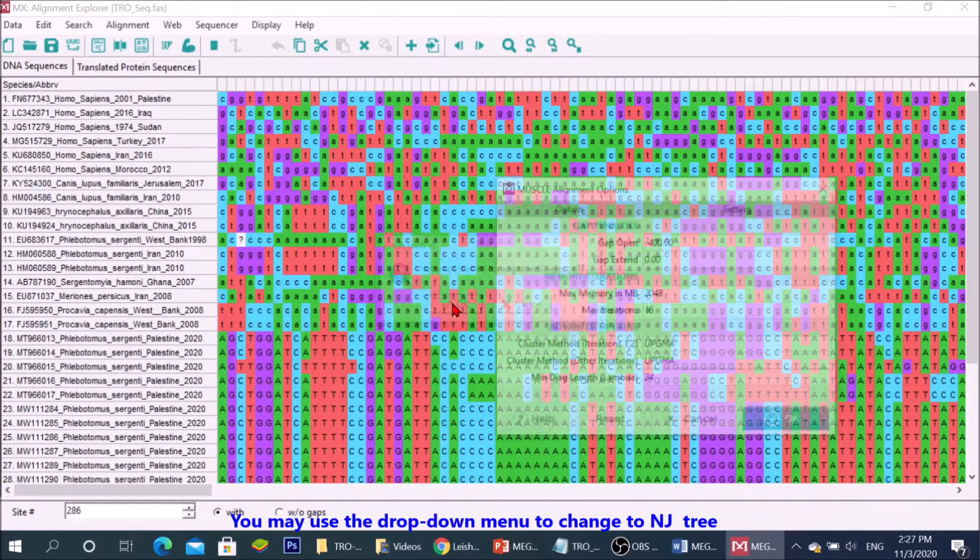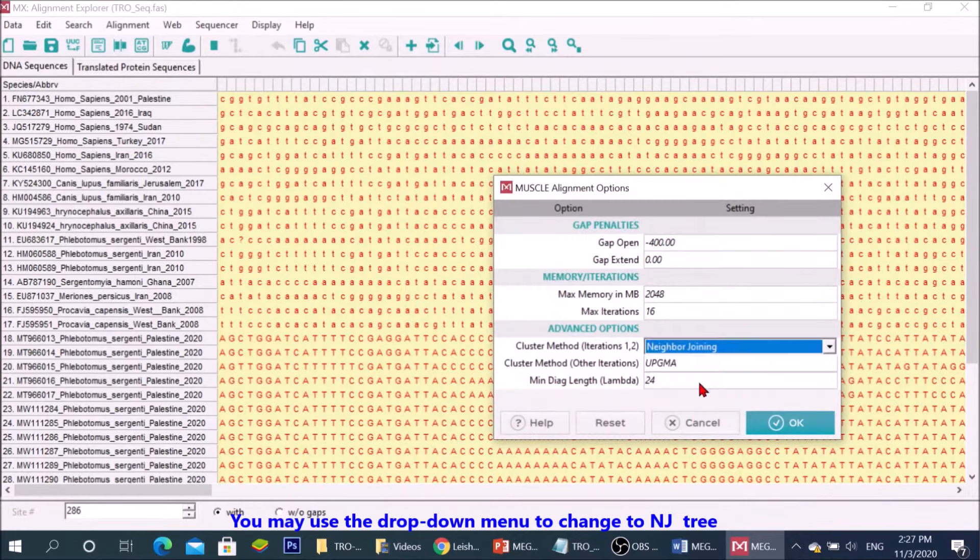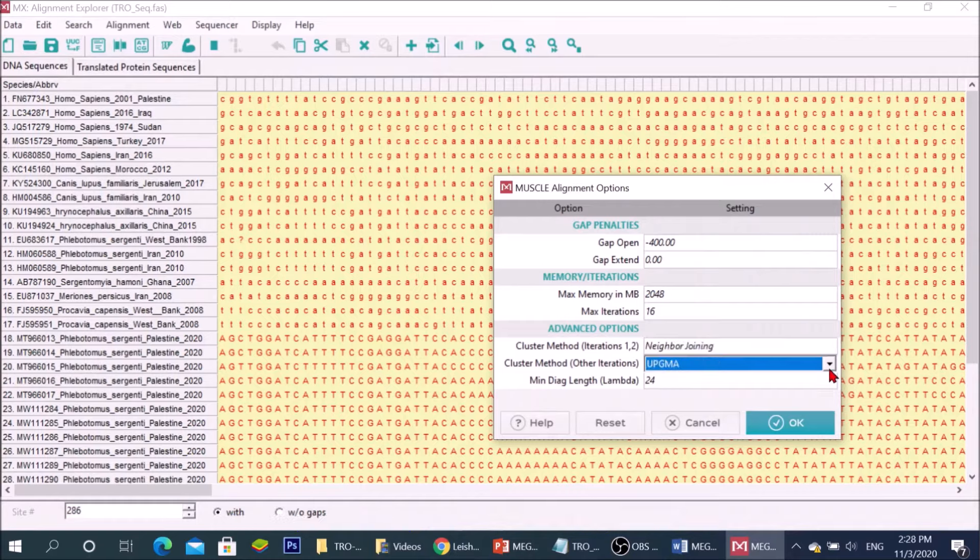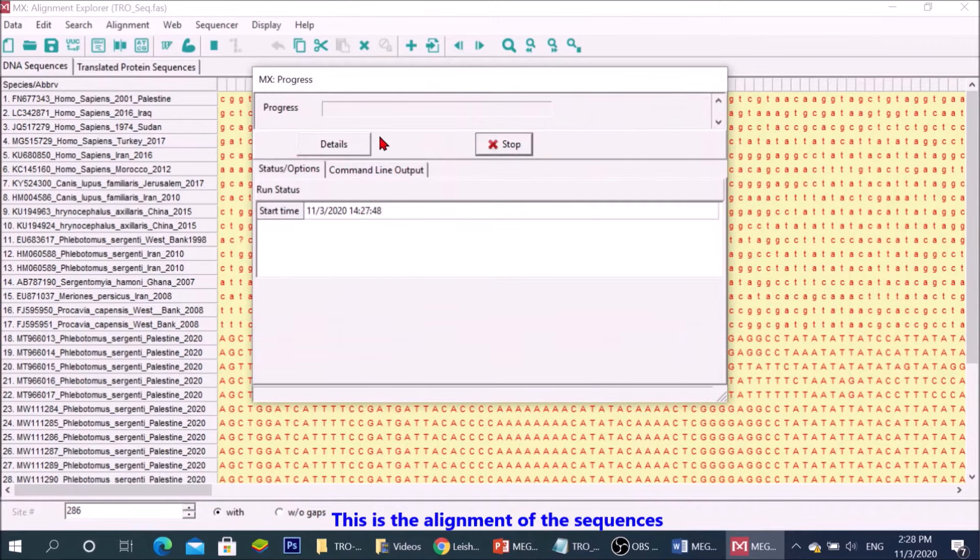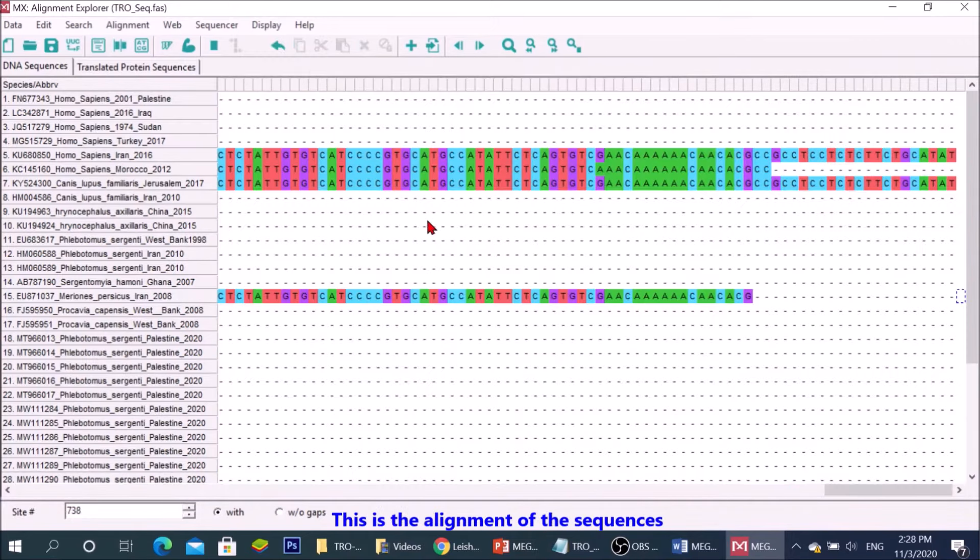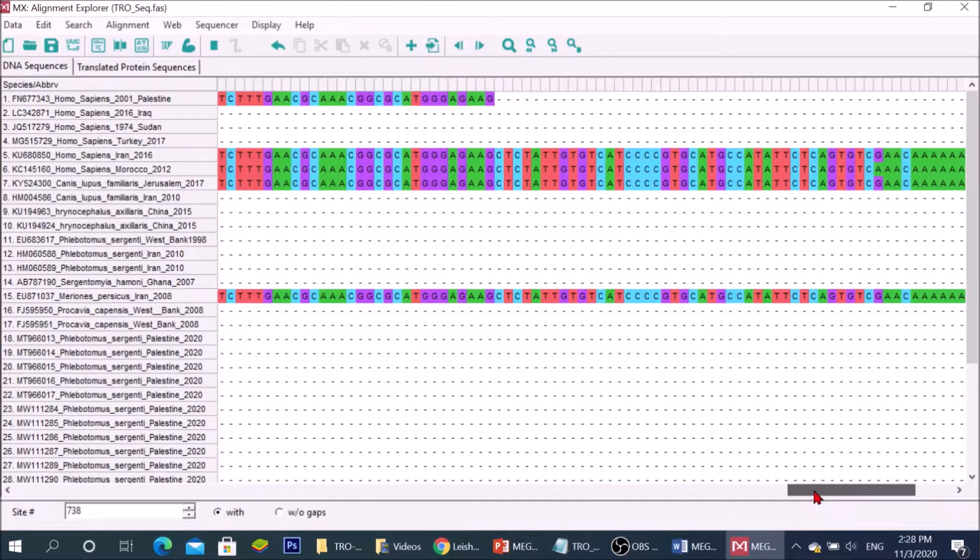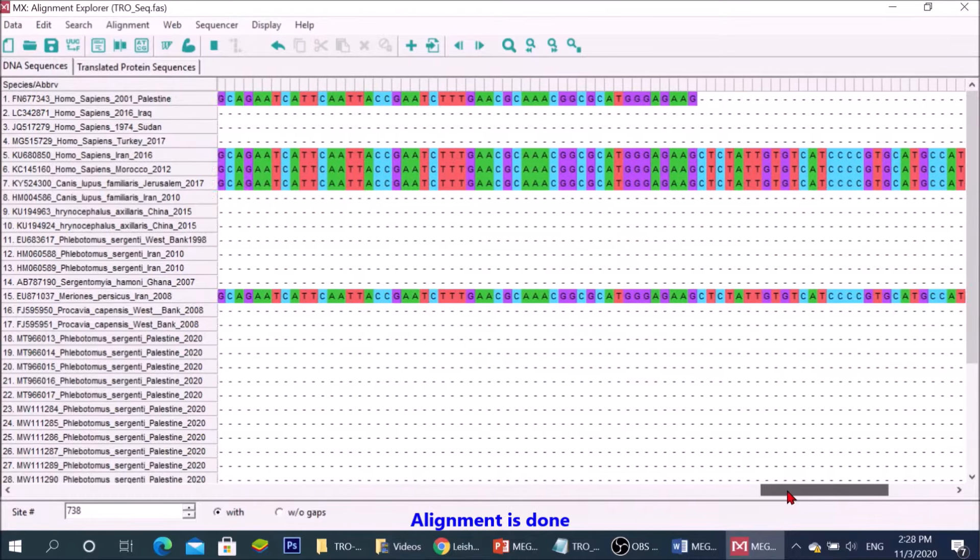You may use the drop down menu to change to neighbor joining tree. Click OK. This is the alignment of the sequences. Alignment is done.